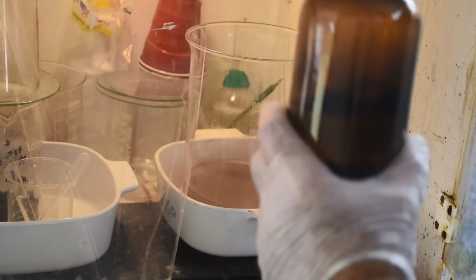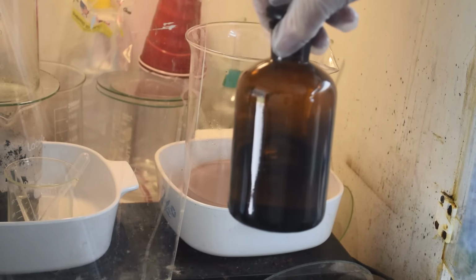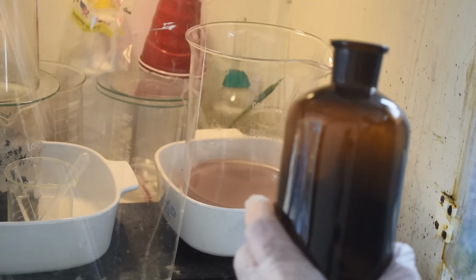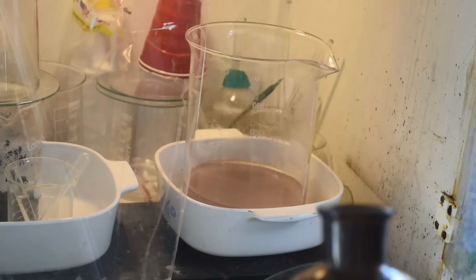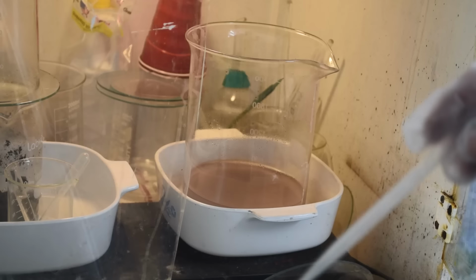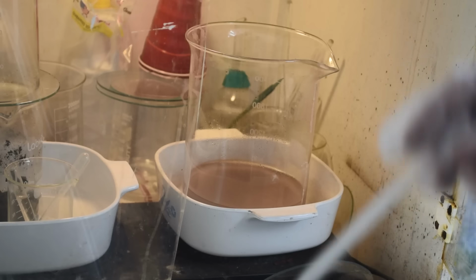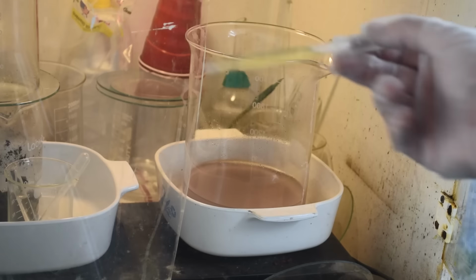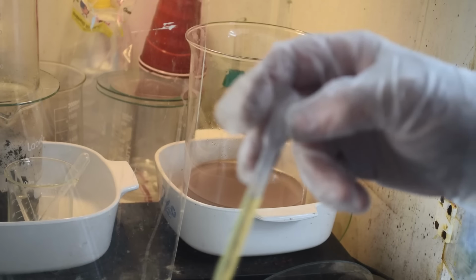All right, next we're going to put some nitric acid in. I've got my brown acid bottle here with my homemade nitric acid in it. And I will put a link in the upper right to my nitric acid production video. It's part of my series on forbidden chemistry. So nitric acid made entirely from scratch.